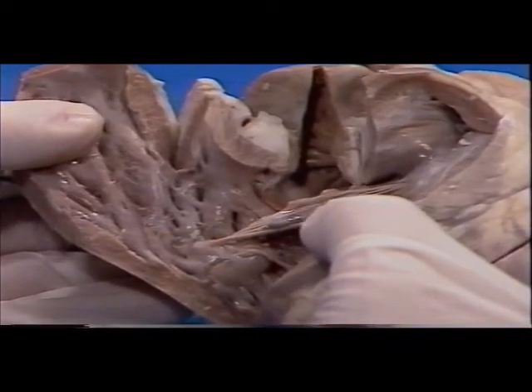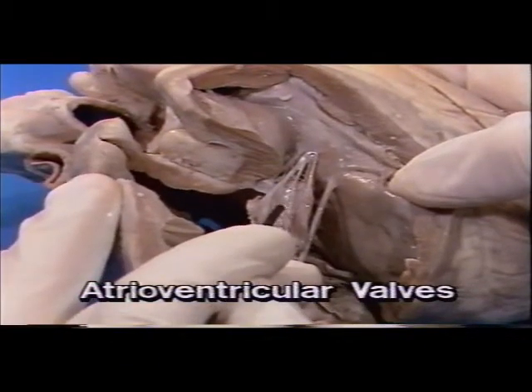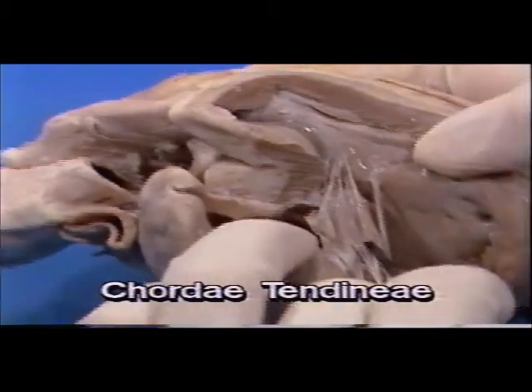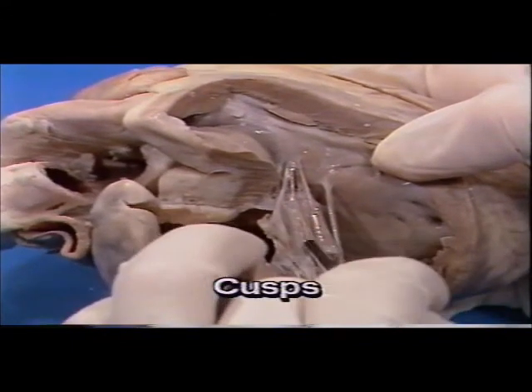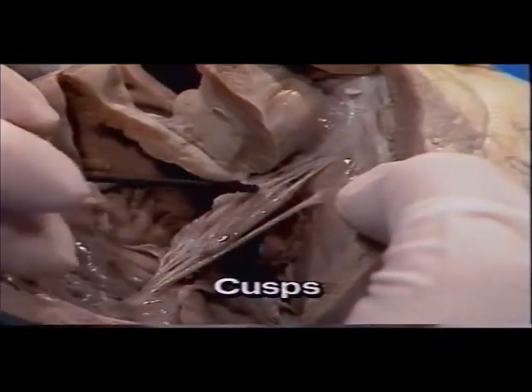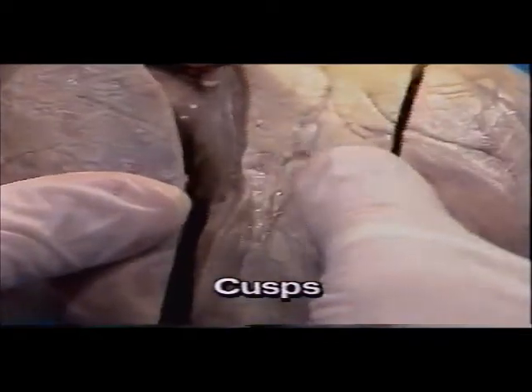We also see portions of the atrioventricular valves, including the chordae tendineae and the cusps, or leaflets of the valves. Observe that there are two parts to the left valve.